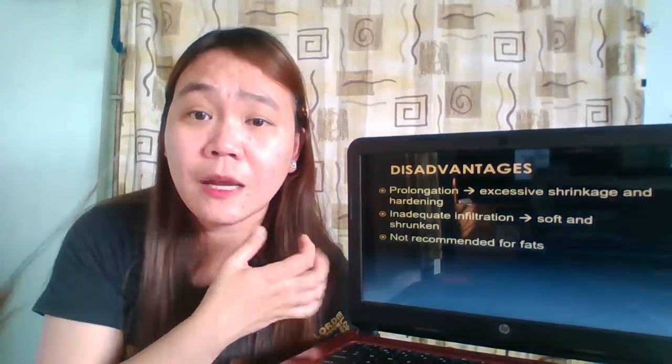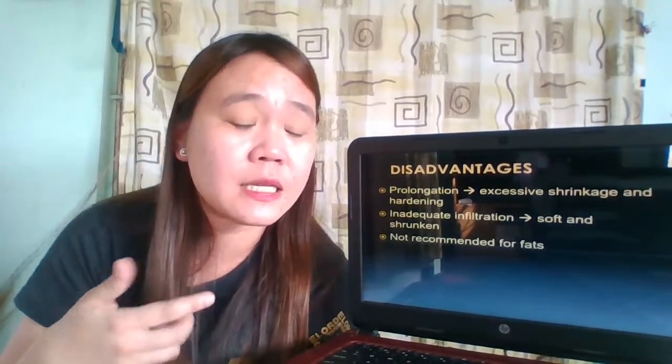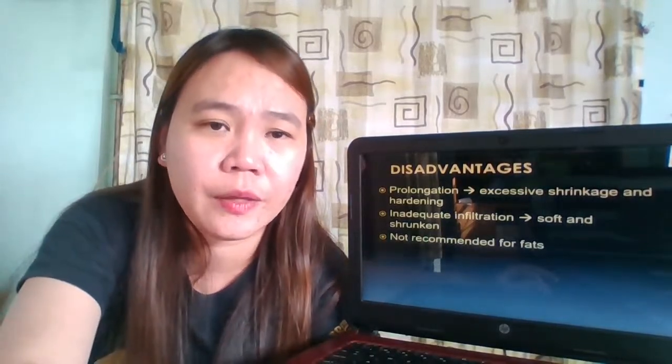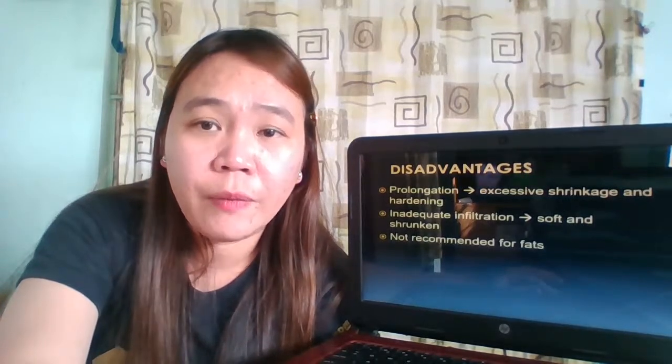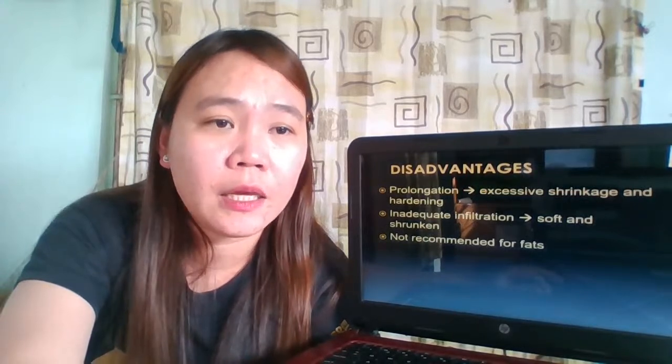Later on, we will be discussing the different media which may be utilized for these tissues which are difficult to infiltrate. So what are the different methods? This is quite long.